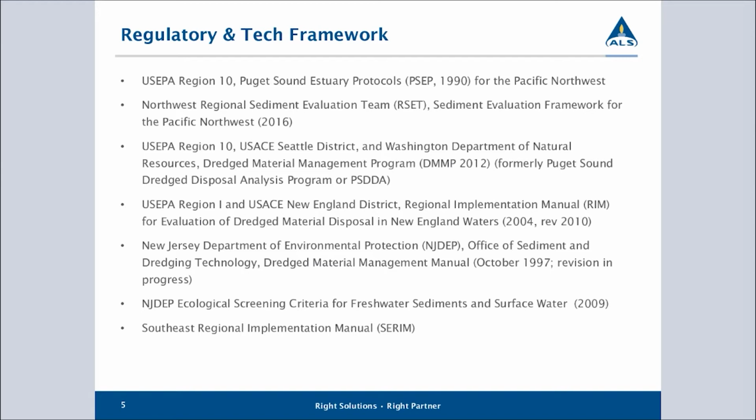Dredging material characterization and sediment cleanup assessments generally involve the use of a variety of physical, chemical, and biological information to reach a decision about risk and how to dispose of or remediate contaminated sediments. So many sediment management programs require extremely low level detection limits. A lot of times this presents a challenge to the laboratory due to the potential analytical interferences related to complex matrices that we typically see in sediments and tissues as well as marine waters.